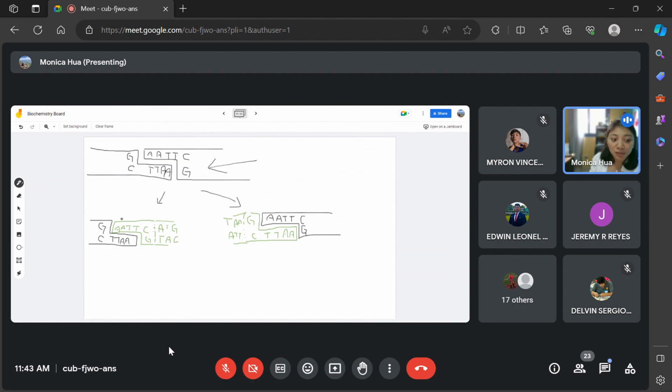On our plasmid, meaning the beginning sequence will have your restriction enzyme site before your ATG, and after the stop codon, you will also have your restriction enzyme site, right? Which is the same here. So in the end, you have your stop codon TAA, and then your restriction enzyme site. In the beginning, you have your ATG, and in front of it, you have your restriction enzyme site.